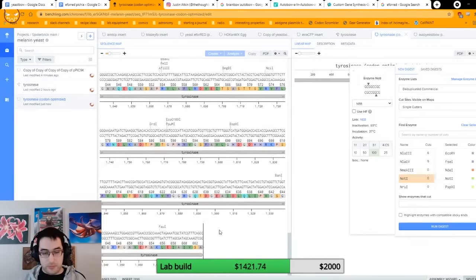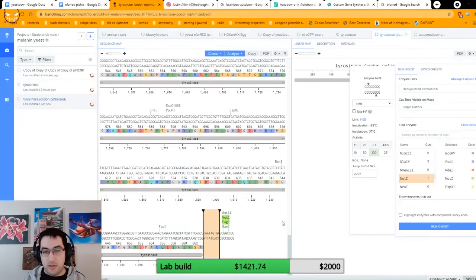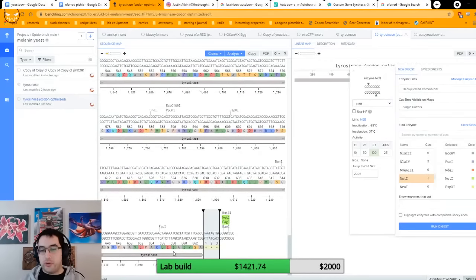If I were to just do this, I've got my restriction site, but the gene doesn't know where to end. So it also needs an ending. I always use the same ending, which is TAA, TAG, TGA, and that's usually fine. Click enter. Now if I go translate, create translation, forward, it's all stars. So this is all stop codons. This is basically guaranteeing that the protein ends here. It won't keep going by accident, because that would be very bad.